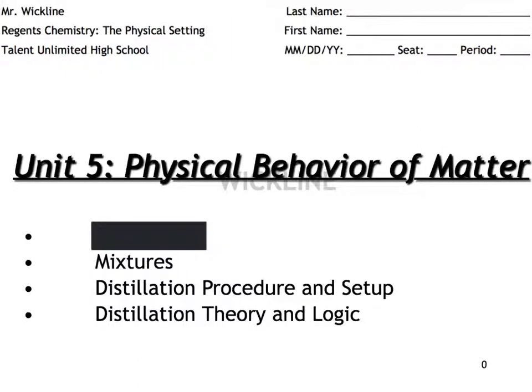Hello all, in this lesson we are going to be studying mixtures, distillation procedures and setup, and distillation theories and logic.